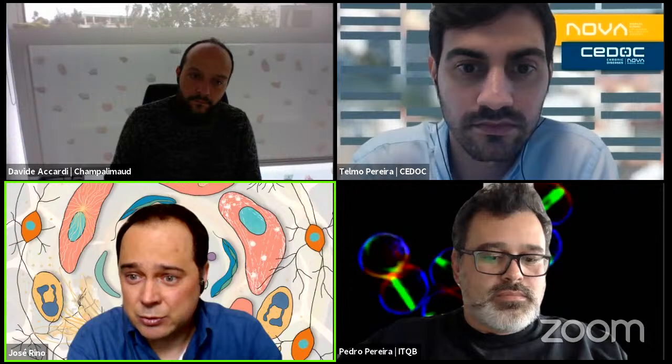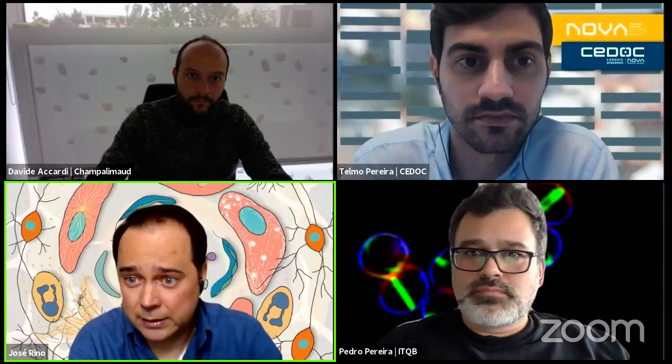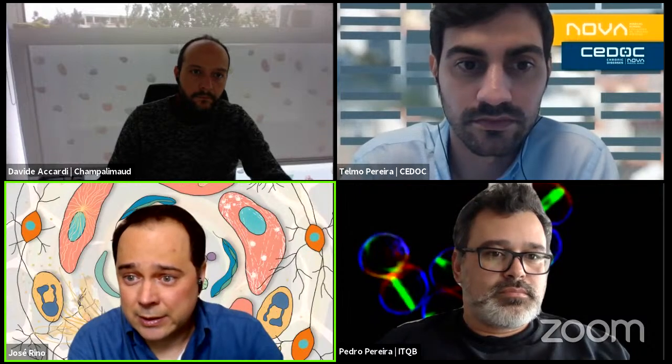So this might be a tricky one. I mean, we might go for specific bandpass filters with very narrow excitation and emission to separate both dyes, or we could go with spectral imaging, which we can also do at COLife. We could acquire the emission spectrum of these fluorophores in the confocal prepared for spectral imaging and do spectral unmixing. So there are a couple of options here.